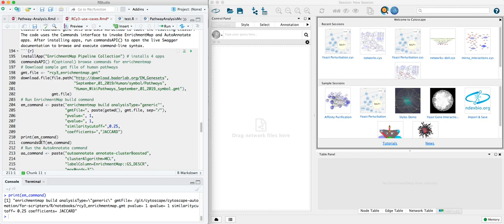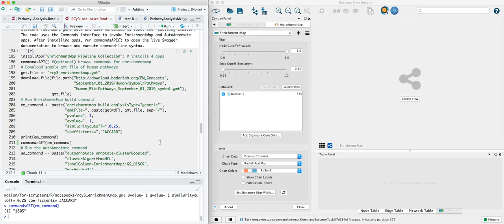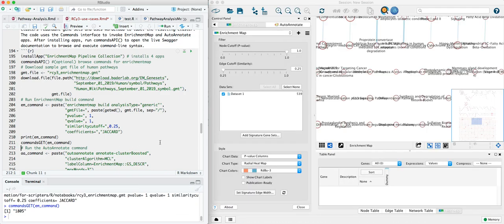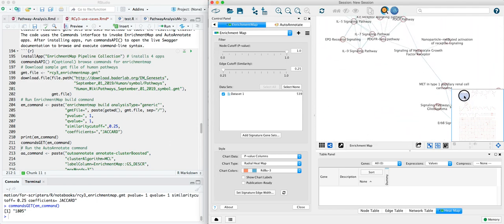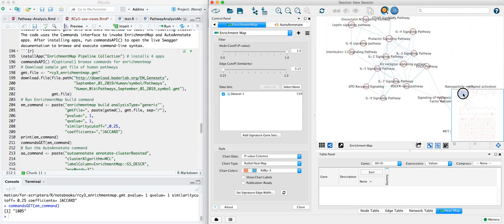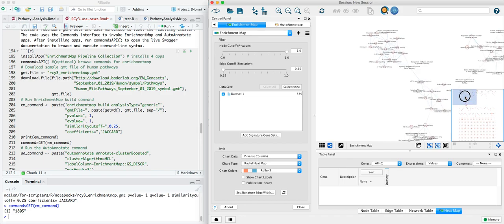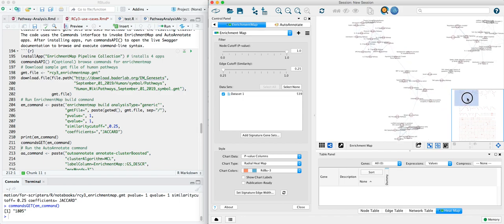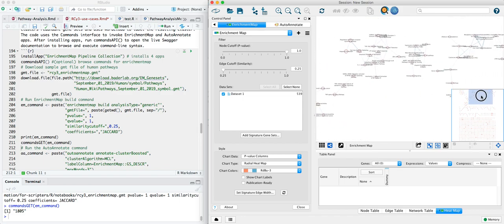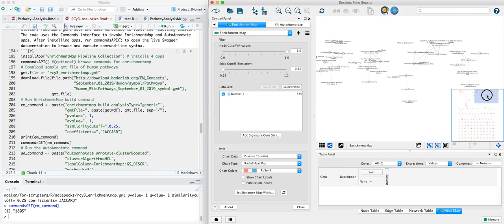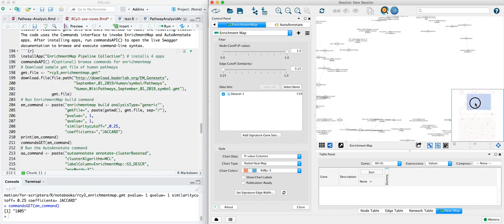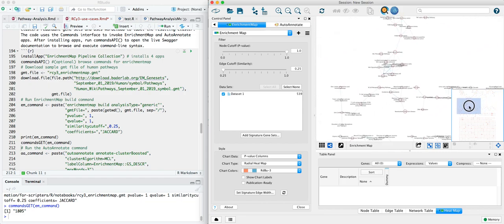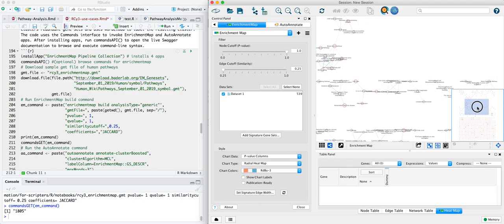To run this command, you simply use the commands get function in RCy3. And now we can watch in Cytoscape as it performs the enrichment map calculation on all of WikiPathways and produces this collection of clustered pathways connected based on their overlapping gene content.